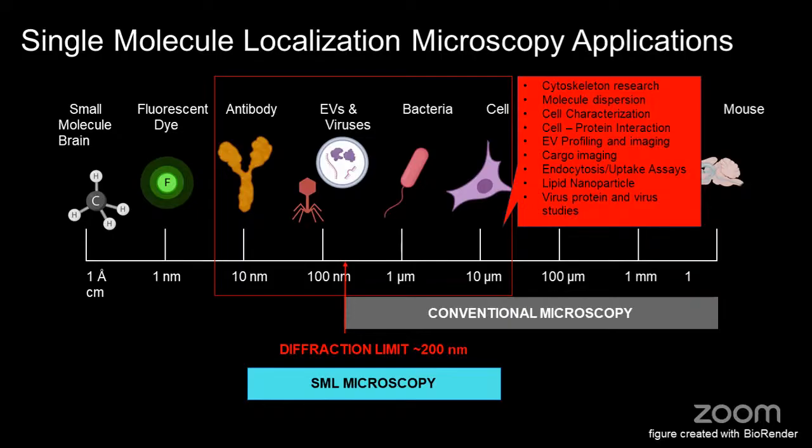I have kept my presentation more focused on virology and microbiology today, and I'll also show you what all you can do in single cell also, which helps you plan your experiment later on in your future if you're thinking about SMLM. So I'll just give you a brief about what all it can do, and also specifically concentrate later on virology and bacteriology as such.